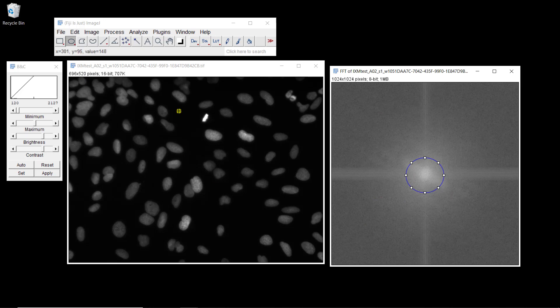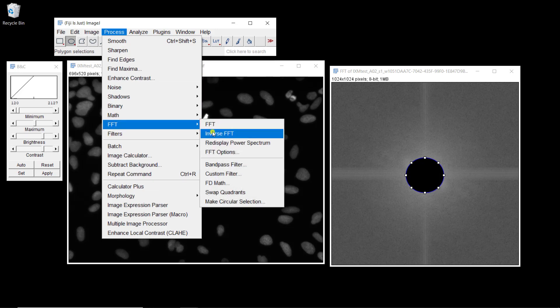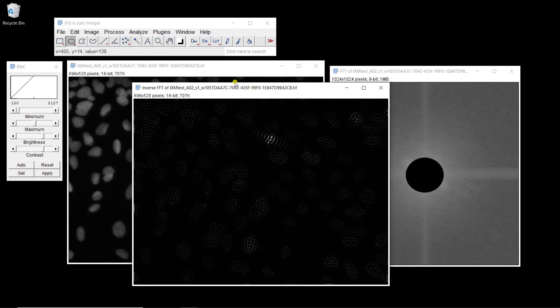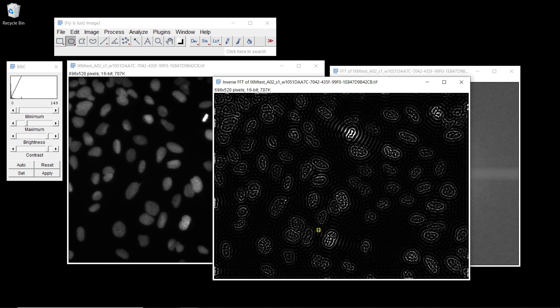Instead of clearing outside, we're going to clear inside — Edit, Clear. And we're going to do the Inverse FFT of this image: Process, FFT, Inverse FFT. This is what you get. What's very different now — that's the high fluctuations of intensities. You see it corresponds to regions inside the nuclei where the intensity is changing, like the dots inside the nuclei. You can see it's reproduced in the high frequencies, as well as the contours, because contours are regions where the intensity is changing from background to nuclei, so it's changing quite a lot — and you can also see the contours.